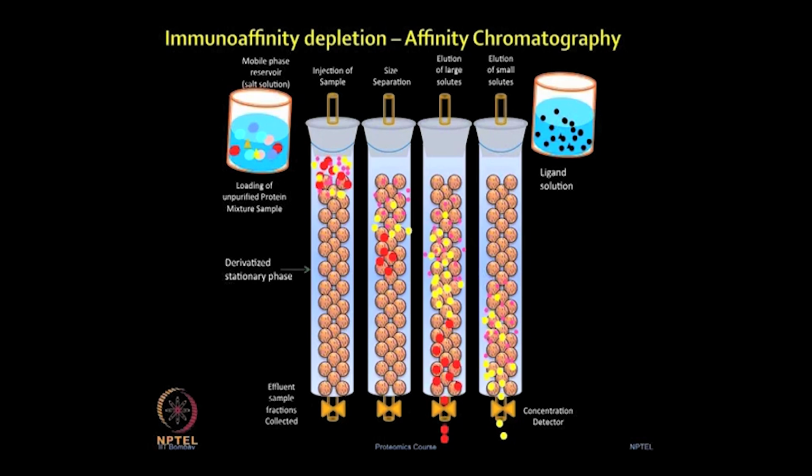So, to eliminate those highly abundant proteins, the authors used the multiple affinity removal system from Agilent Technologies, and they removed the most highly abundant proteins from the serum sample, including albumin, IgG, antitrypsin, IgA, transferrin and haptoglobins. After the abundant proteins were depleted from the serum sample, the authors moved on to protein extraction and further analysis.